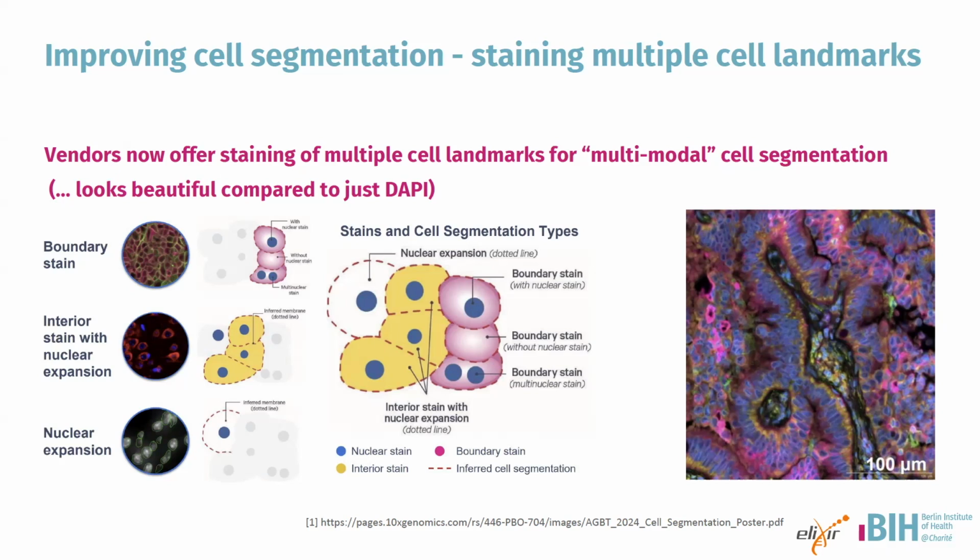I think this kind of methodology is fairly new, and I don't think there are any robust evaluations of how well this works compared to other methodologies, but I would imagine there are people working on this. But it does really produce much richer, beautiful images of your tissue compared to just a simple DAPI stain.